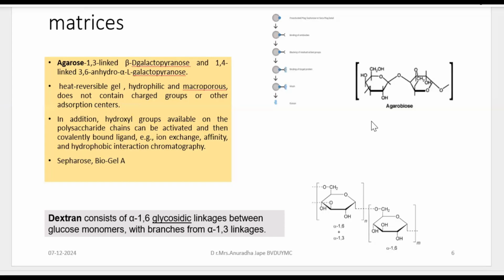For example, in case of TLC, we have seen that to equilibrate the chamber, we prepare the solvent system in the glass chamber, and its lid is kept closed, and the vapor phase is allowed to occupy the void volume of the chamber. So the chamber gets saturated with the gas phase. Similarly, here you are going to equilibrate the column, so there are no gas spaces or air spaces remaining, and a continuous smooth flow of the mobile phase takes place. So these are some basic instructions when we talk about the column packaging and its activation or equilibration.